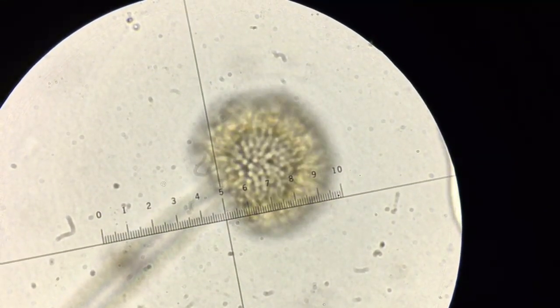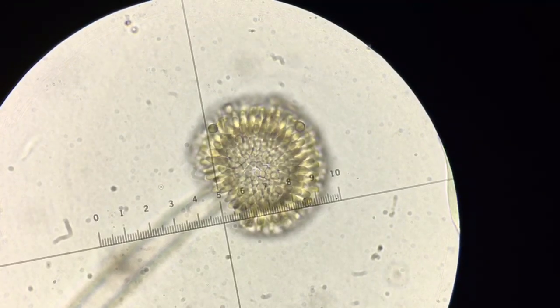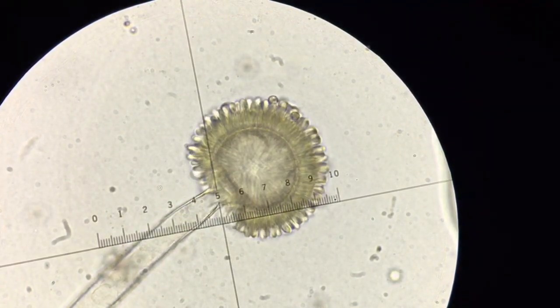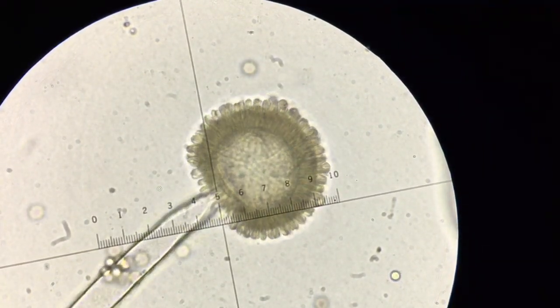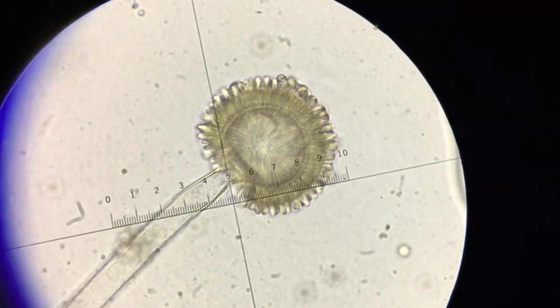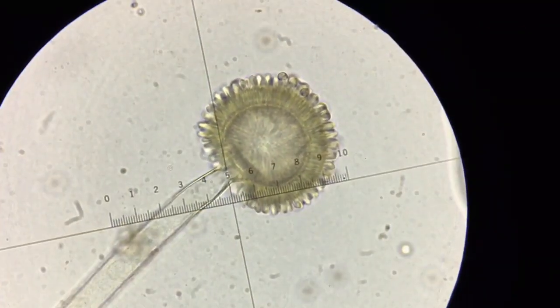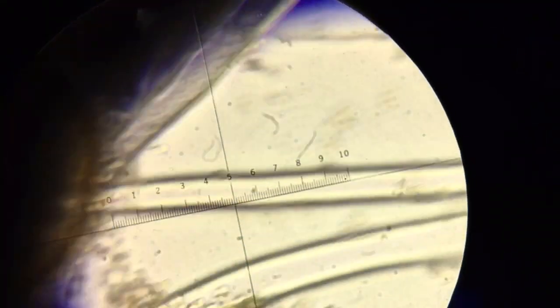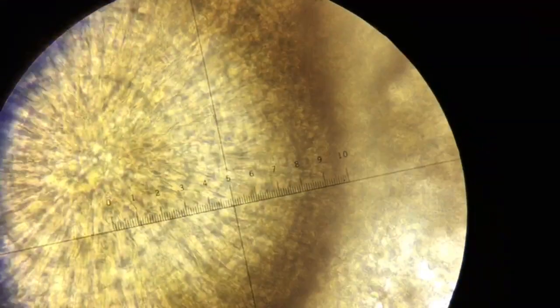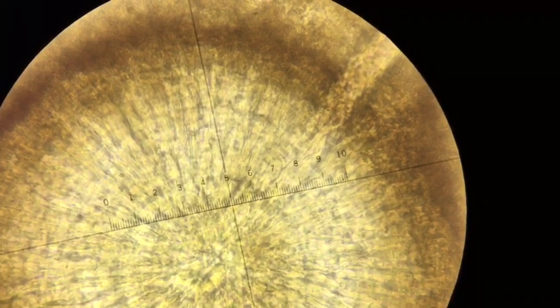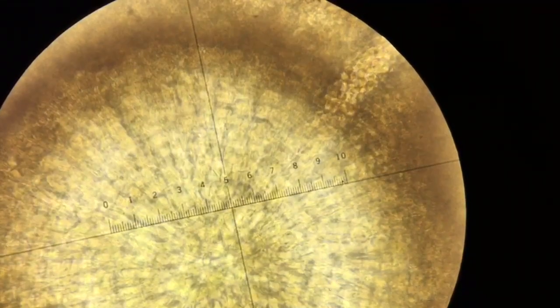It has to do with how many stages there are in these phialides. In this case, because it's an immature conidiophore, we see only one stage directly off the vesicle, but in the mature conidiophore we're going to see two, and I don't know if the quality of the video can show it or not.